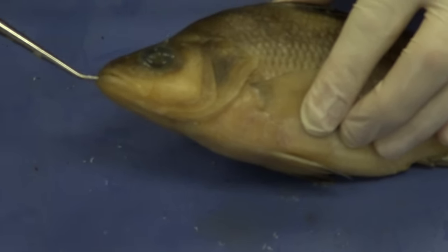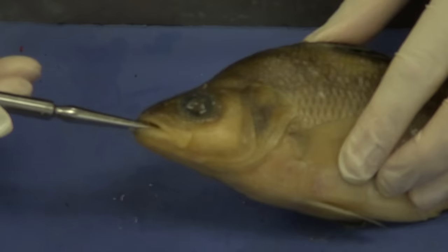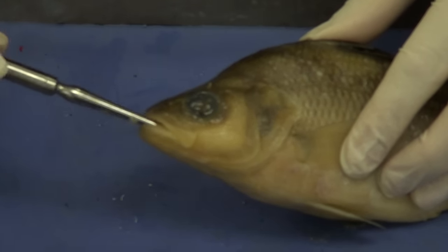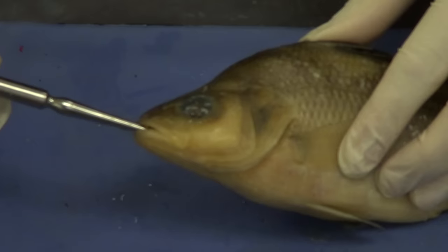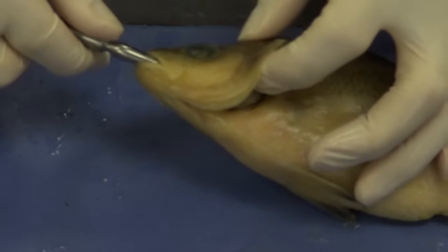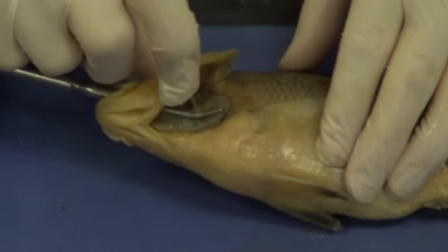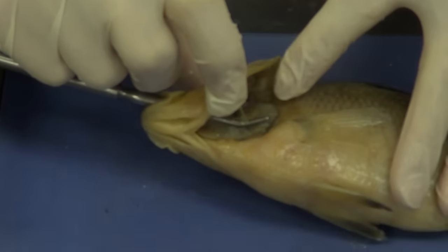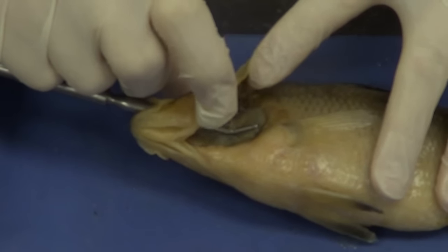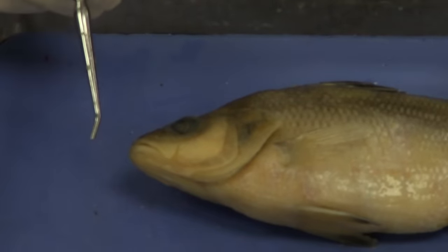If I take the probe and enter the fish's mouth, it can go in one of two areas. It can go straight back into the stomach — that's where food would end up. Or if the fish opens its mouth and lets water in, the water will go over the gills. You can see the probe coming out where the gills are. Water would actually go over those gills and gas exchange would take place. Make sure you actually do that and see it for yourself.